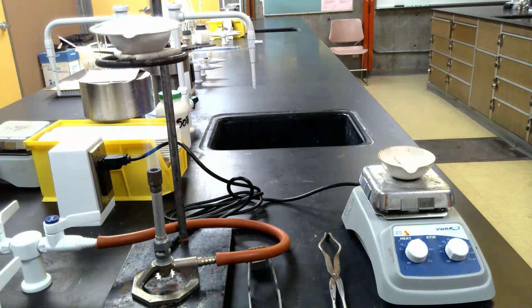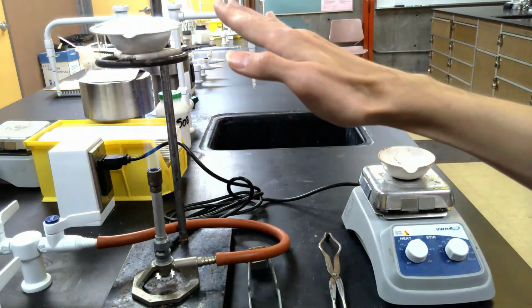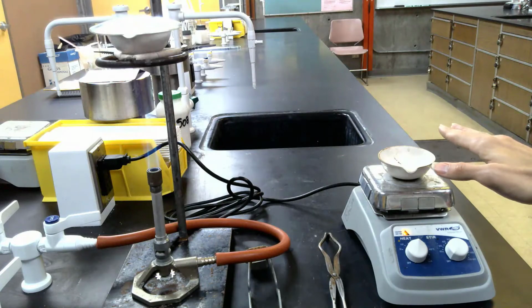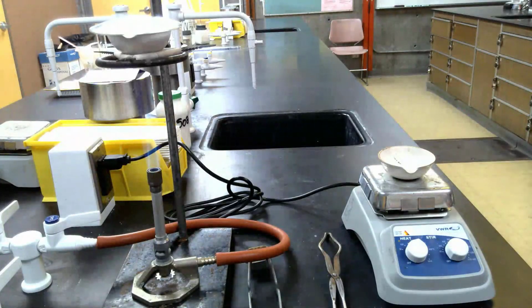So with that, I'm just going to let these do their thing, and when they've reached the endpoints, I'll pull both evaporating dishes off, let them cool. Ideally, this dish is only going to have salt crystals left behind in it. This dish is only going to have dry sand. So once they've cooled, I will just weigh them, get my measurements, and see if they match up.